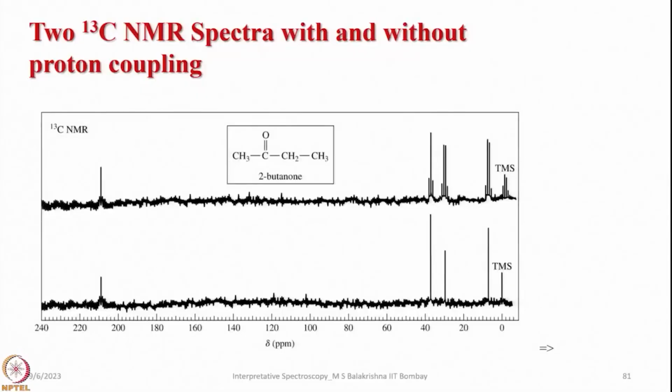If you recall the spectra I showed in my last lecture, you can see here the 13C NMR spectra is recorded both with coupling and without coupling. This is without coupling. Once we write in the flower bracket any nuclei next to the one we are looking at, that indicates any signal due to this one is decoupled. And this one is the coupled one.